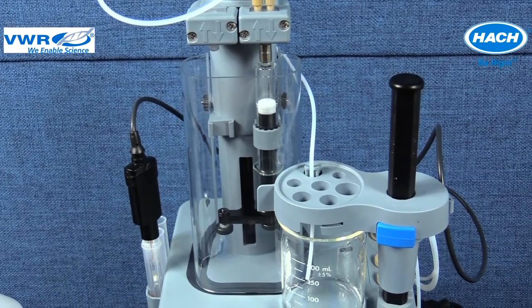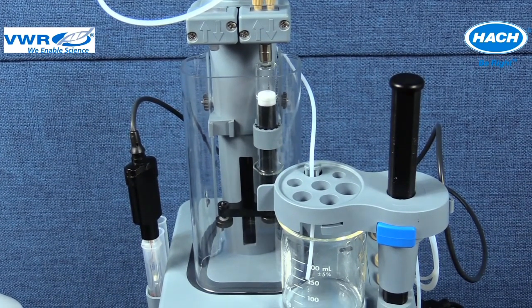When the syringe purge function is selected for that position, the titrator pulls titrant from the titrant bottle, fills the syringe several times, and dispenses the titrant to the sample beaker. Any air bubbles in the syringe should be evacuated during the filling and dispensing action. Fresh titrant is seen leaving the dispensing tip.